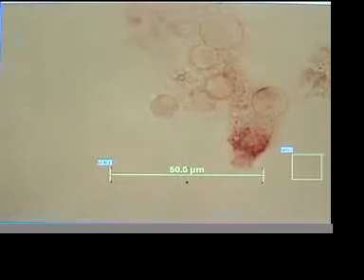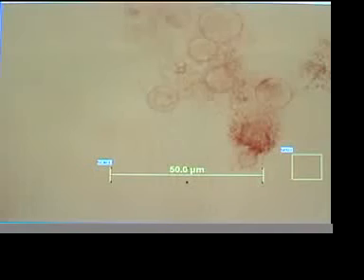Incredible. Look at that. Forms hundreds of tiny little bubbles or spheres or blisters. Explodes into a series of large and small spheres. And now I'm going to center the picture a little bit. And then sometimes continues to disintegrate.